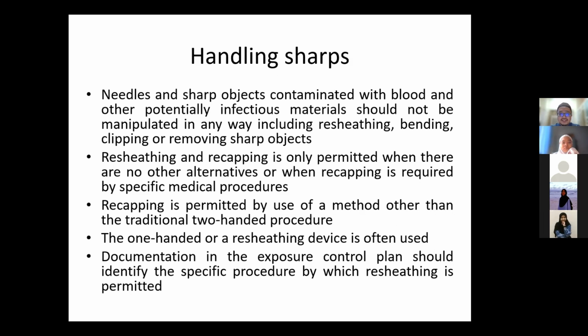Okay. Handling sharp needles and sharp object contaminated with blood and other potentially infectious materials should not be manipulated in any way, including resheathing. Maknanya dia asalnya dalam ada cap, you unsheath, you buka, you don't need to resheath the needle. Okay, dia macam itu you buang. No need to resheath because that increase the risk of getting sharp injury. You do not bend it, you do not clip it, you do not try to remove the needle from the syringe. Okay.